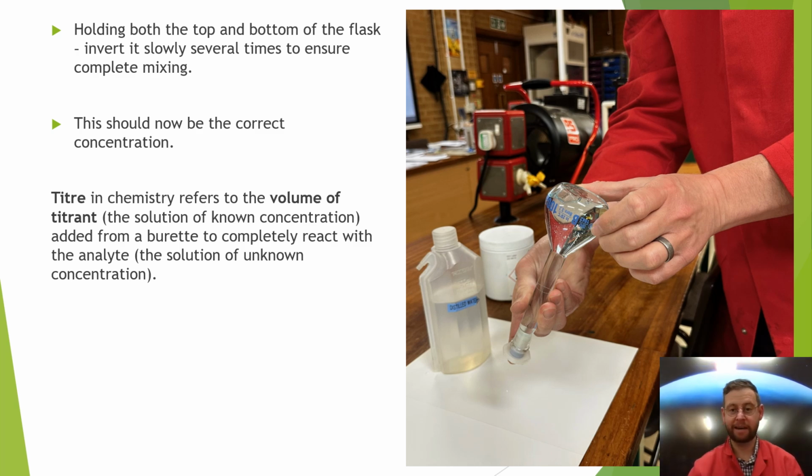You're going to turn it upside down about 3 times, being careful not to take your finger off the stopper, otherwise your solution will be all over the floor. This is now the correct concentration.